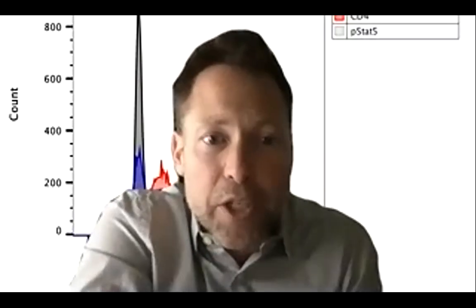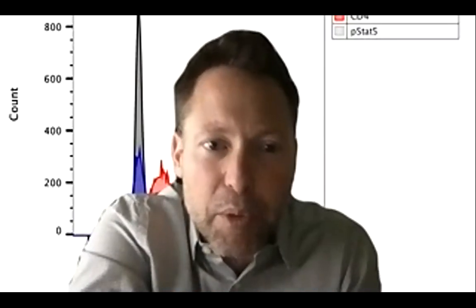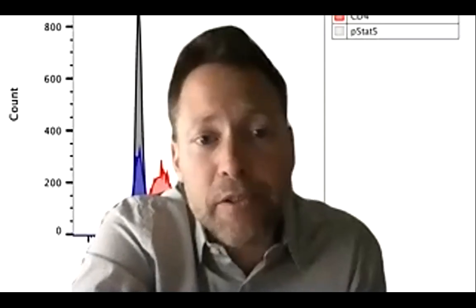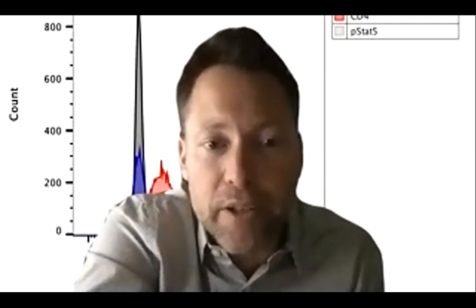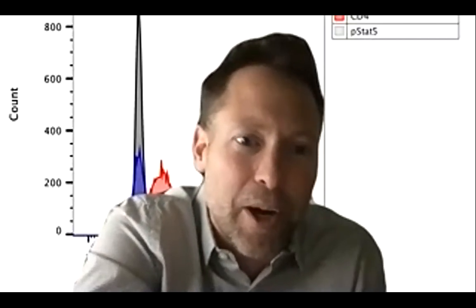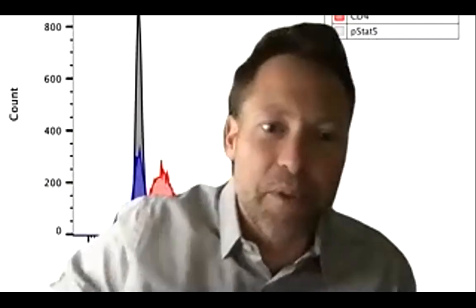Thank you to everyone who replied to our quick little survey poll that came out a couple days ago, which was just asking what topics people are particularly interested in. The first time we did this, we tried to cover a little bit of everything, so this time I thought it'd be nice to hone in on the things people were particularly interested in. The winners in the survey were basically the dimensionality reduction tools and the clustering tools, and perhaps comparing the differences between them and when you might use one versus the other. So I will focus on that. FlowSOM, as an independent tool, was, I think, the second highest vote receiver, so I'll make sure we talk in some depth about FlowSOM as well, but I'll touch on all of them, or at least almost all of them. There's a handful that I'll just say, this one's a man.